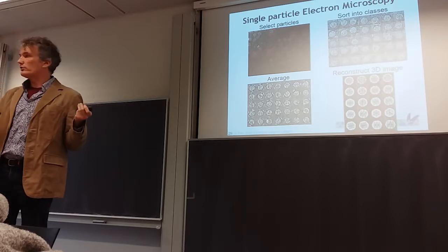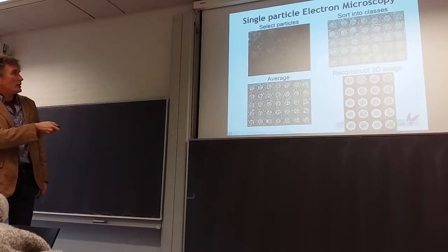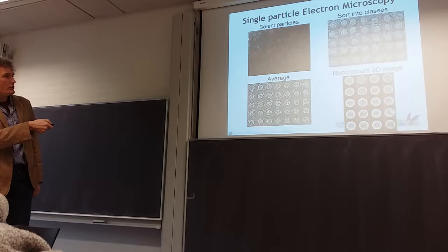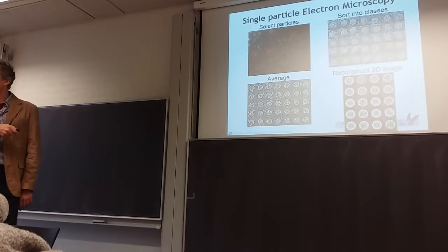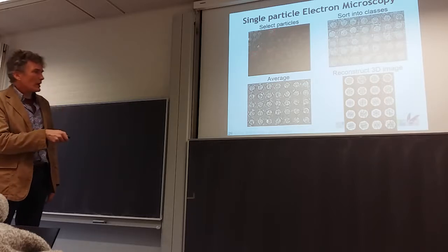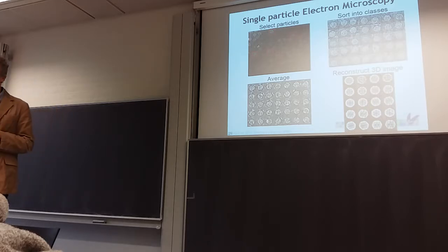This is then just different cross sections through the reconstructed 3D image. So you can see that this is 25 years ago. The resolution is very low. Nowadays you can get much higher resolution. But you can see the shape of the spherical virus capsid. You can also identify the individual protein molecules. These bright spots are the individual protein molecules. And you can even recognize different hexagonal and pentagon shapes that you have in this particular virus capsid geometry.